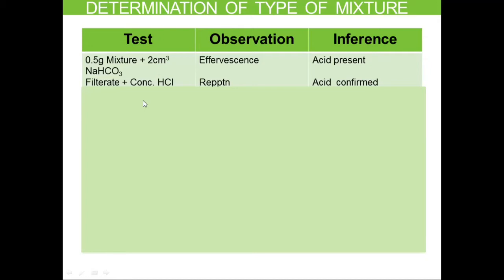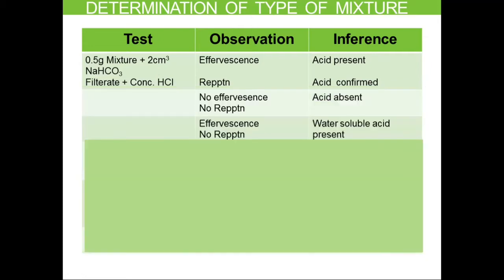We then filter it and to the filtrate add concentrated HCl. However, there was no reprecipitation. Where we get effervescence but no reprecipitation, the inference would be that a water-soluble acid may be present. We confirm the medium is acidic enough by placing a drop of the filtrate on blue litmus paper — it turns red. Still no reprecipitation, hence a water-soluble acid may be present.